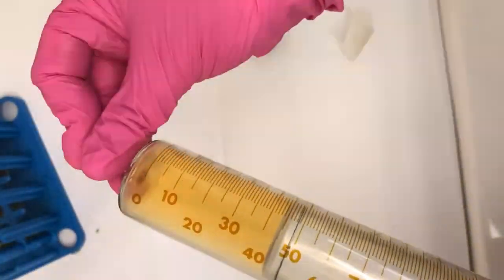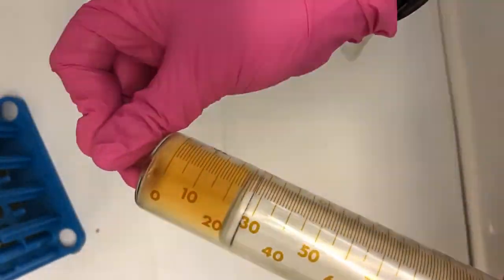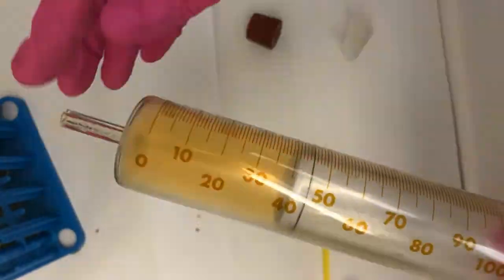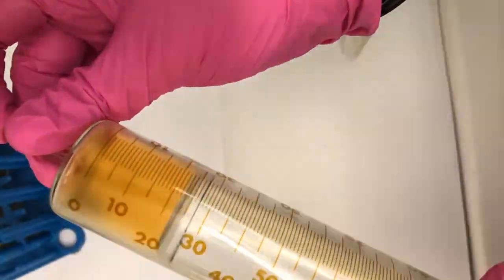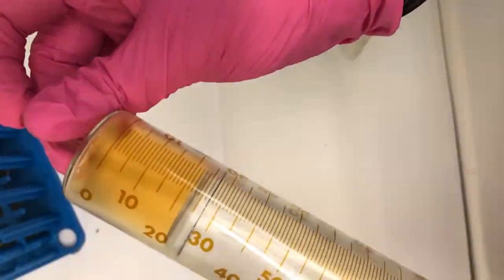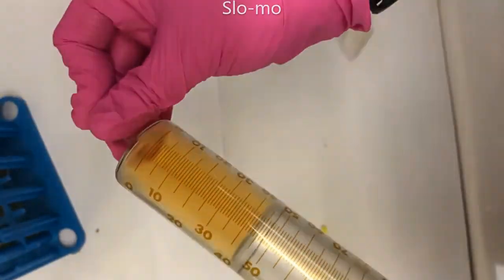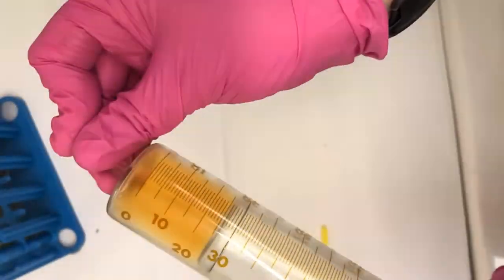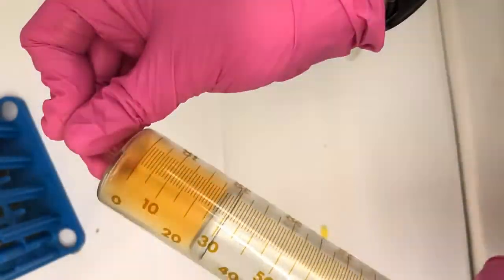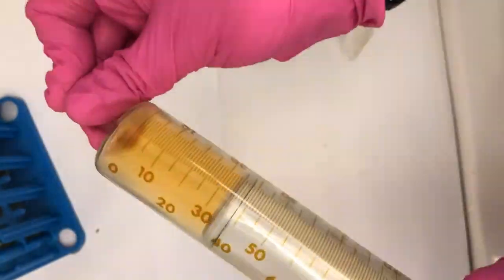Let's look at it a third time. Darker, paler. Okay, I might copy and slow down this clip just to make sure you can all see it. In this slow-mo clip, I want you to pay attention what happens to the colour when I depress the syringe, both immediately and after a second. And then what happens to the colour when I release the syringe, and again, immediately after that release, and then a few seconds later.